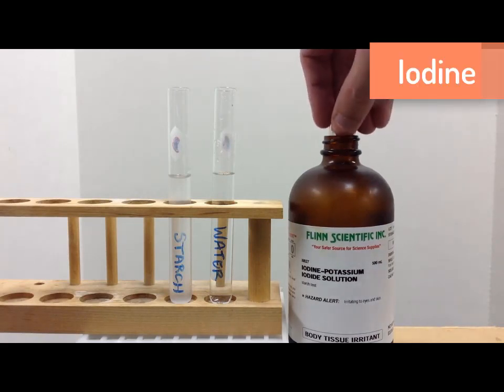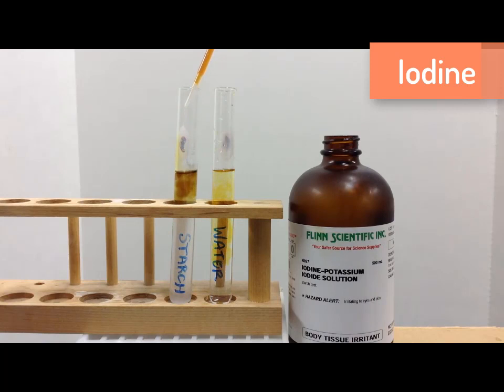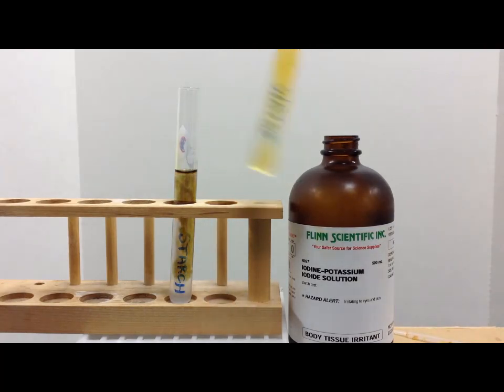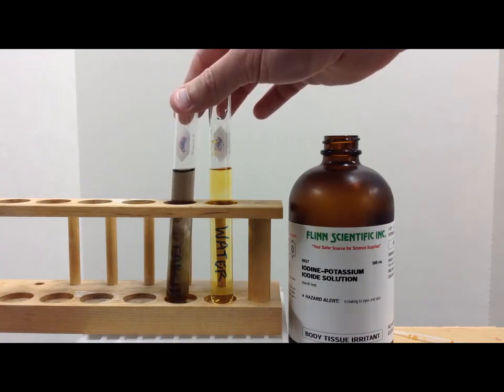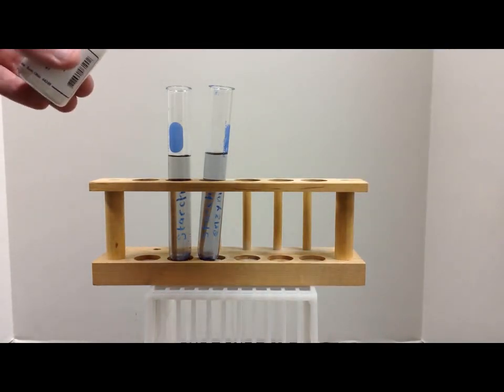We'll use an iodine solution to test for the presence of starches. Normally this solution is a yellowish color, but when it mixes with starch, it chemically reacts, becoming a very dark purple or black color. This makes it evident that starch is present in the solution. Our iodine solution has been used to show that both of these test tubes contain starch.